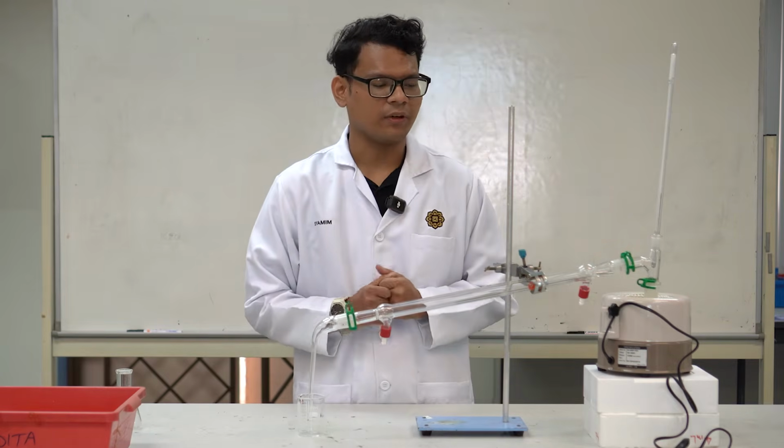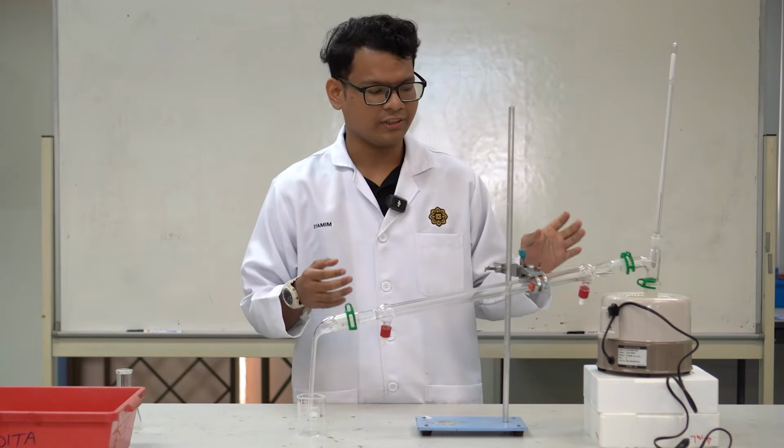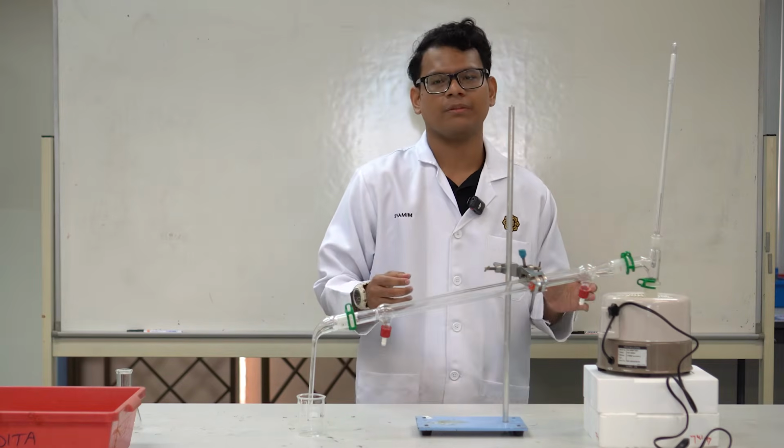Lastly, the problem statement. The problem statement of this experiment is that we are going to separate dichloromethane and base to obtain pure base.